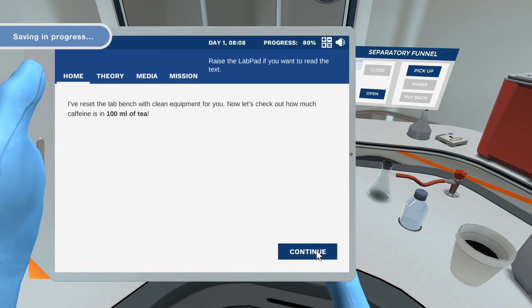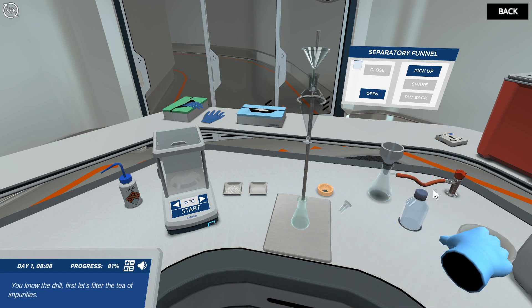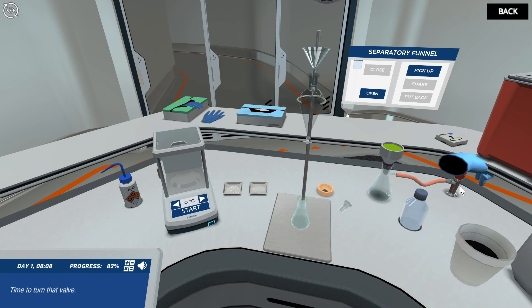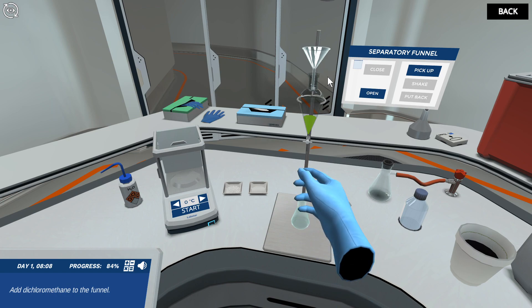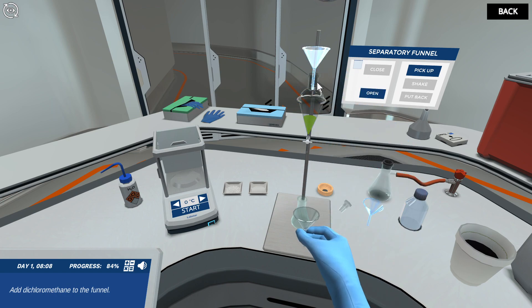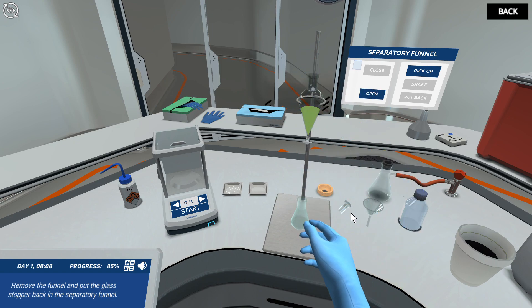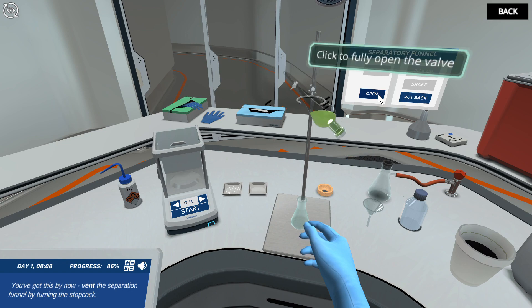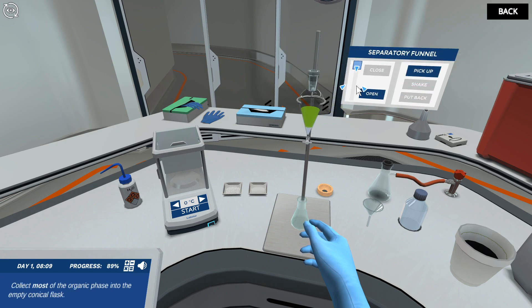Now that we know how to extract, you know the drill! First let's filter the tea of impurities. Time to turn that valve. Remove the Buchner funnel from the filtration flask and add the filtered tea into the separatory funnel. Add dichloromethane to the funnel. Remove the funnel and put the glass stopper back in the separatory funnel. Now pick up the separation funnel and shake it. Vent the separation funnel by turning the stopcock, then close and place it back on the stand. Collect most of the organic phase into the empty conical flask.